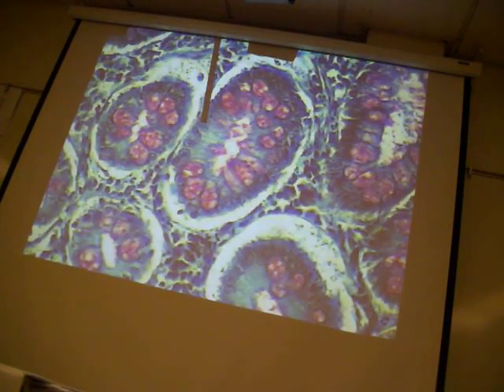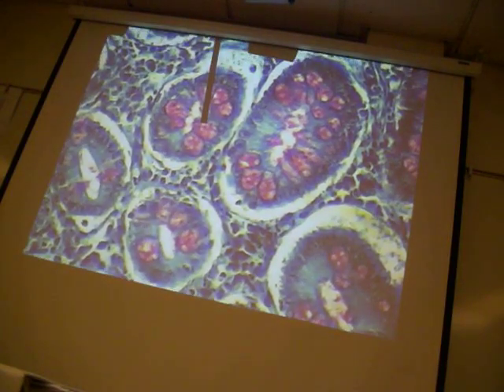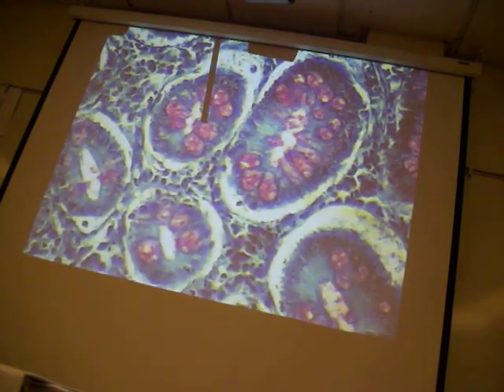Now, with salivary glands or with certain portions of your intestines, they're going to secrete mucus. There is a specialized cell that releases that mucus. This one happens to be stained. See this reddish color stained cell? These are goblet cells. Notice how they kind of look like a perithecium. Remember perithecium, the one that was on your lab practical? That one looks like a little goblet. The function of this goblet cell is to release mucus, to secrete mucus.